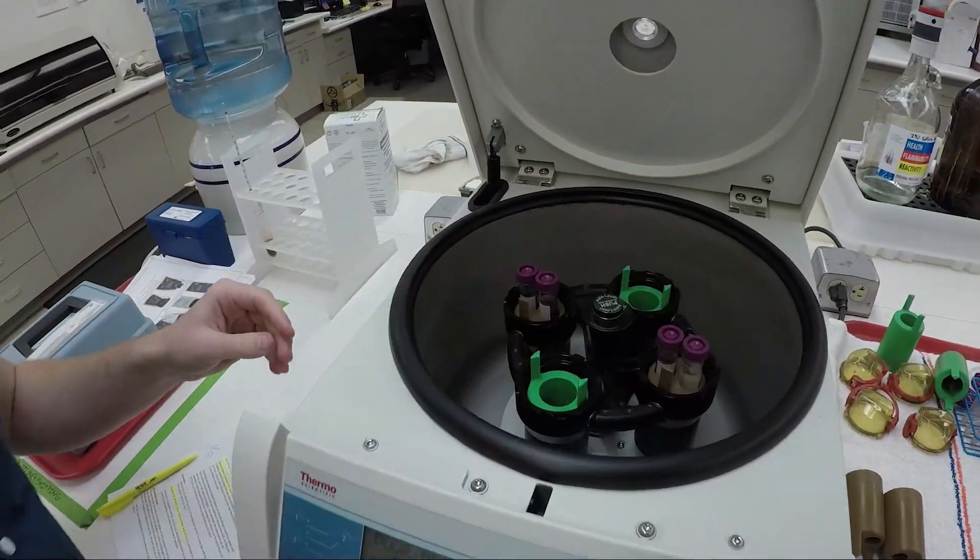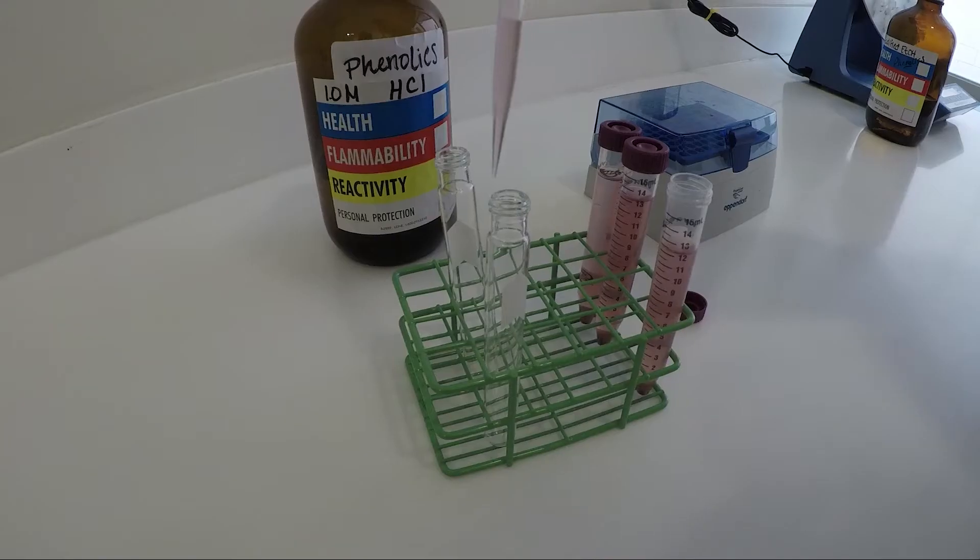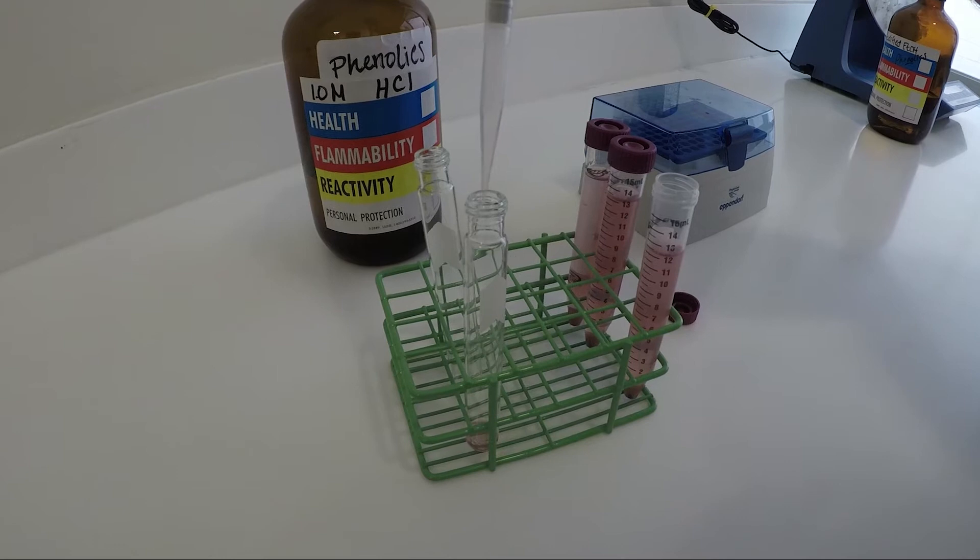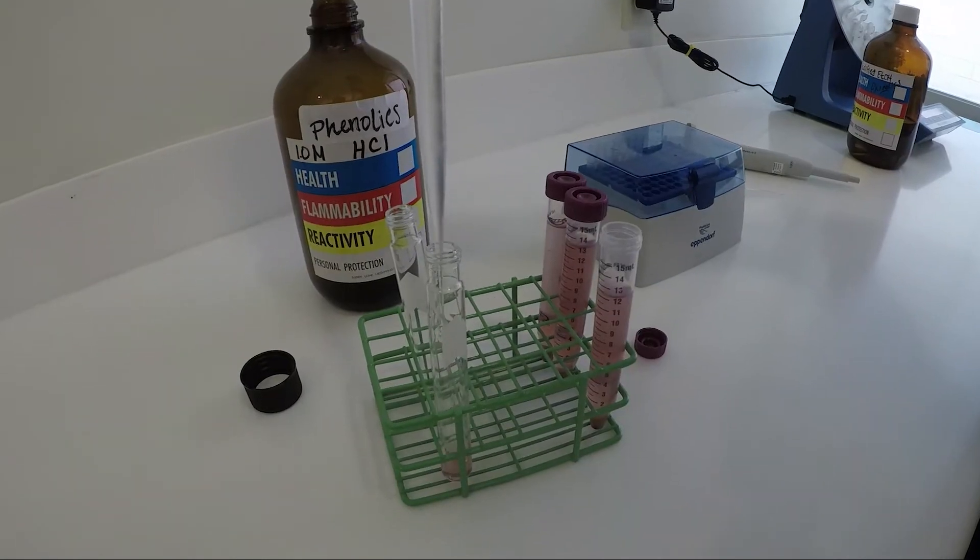After the extraction we'll centrifuge our sample. We'll dilute one mil of our supernatant into 10 mils of one molar hydrochloric acid. Now that we've added 10 mils of HCL to one mil supernatant, we're going to incubate for one to 24 hours in a cool dark place.